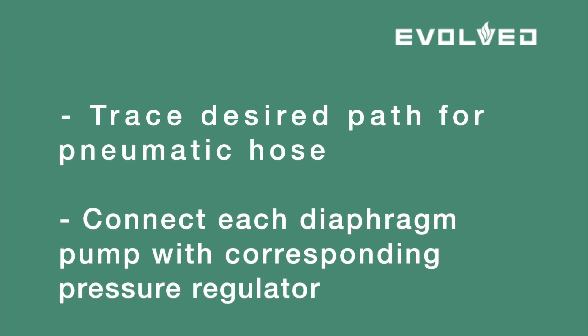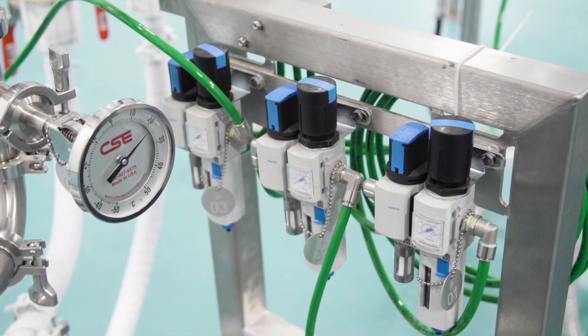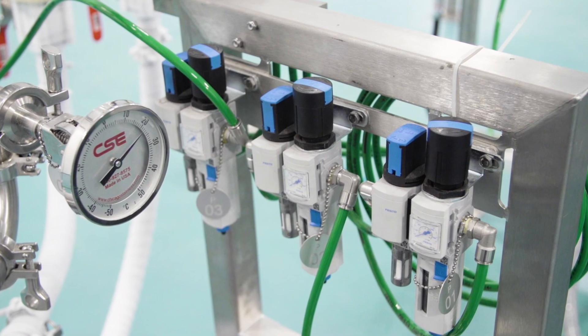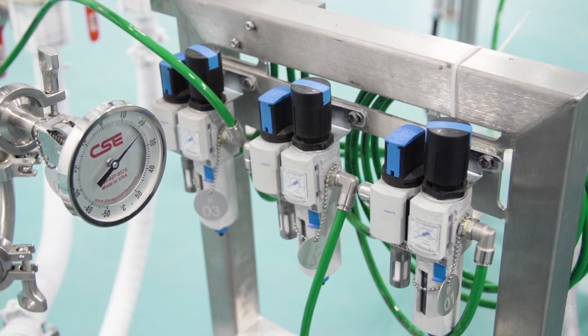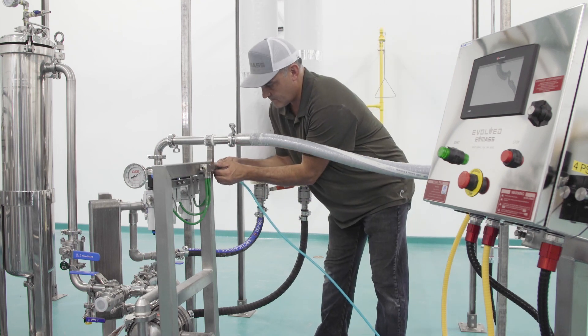It is suggested that during this step you first trace a desired path for the hosing to run, keeping in mind attachment points and desired flexibility. Overestimate the required length by two to three feet to compensate for margin of error in measurement. Measure, cut, and install pneumatic hose to connect each of the three diaphragm pumps to their corresponding pressure regulator on the air compressor manifold located on the frame of the filtration skid. Now connect your facility's air supply to the manifold as shown here by the technician.